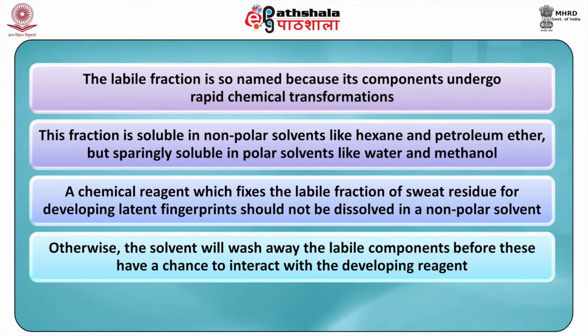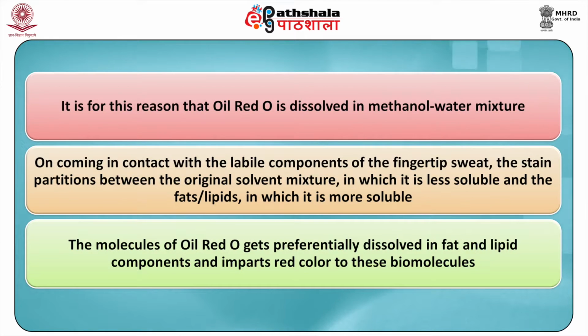soluble in polar solvents like water and methanol. A chemical reagent which fixes the labile fraction of sweat residue for developing latent fingerprints should not be dissolved in a non-polar solvent. Otherwise, the solvent will wash away the labile components before these have a chance to interact with the developing reagent. It is for this reason that the oil red O is dissolved in a methanol water mixture.